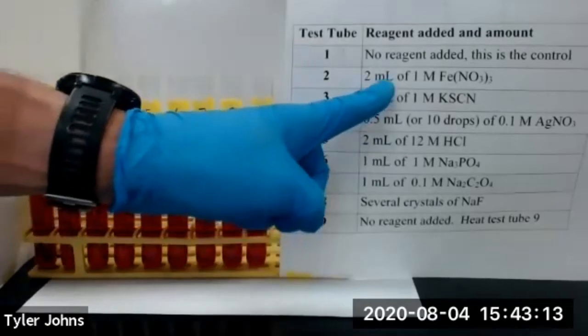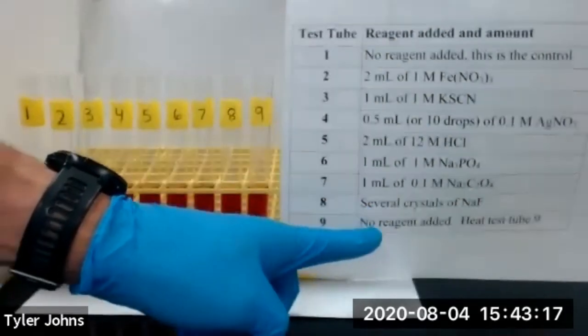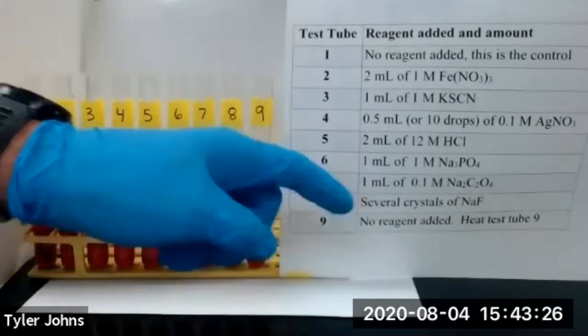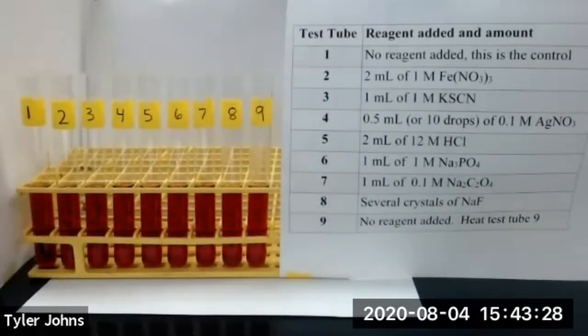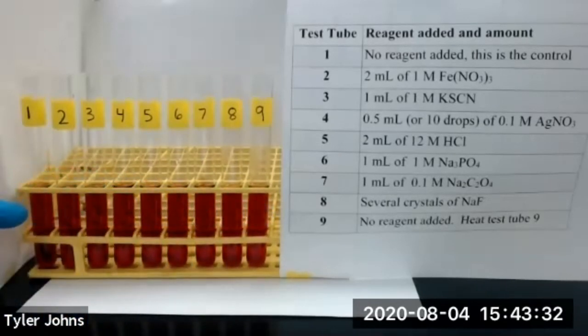We'll add these reagents to test tubes two through eight and test tube nine we will heat. We'll compare the color intensity of test tubes two through nine with the control test tube, test tube number one. You'll need to record observations in terms of Le Châtelier's Principle.